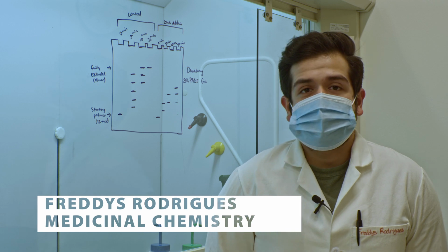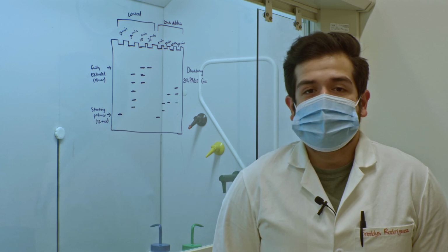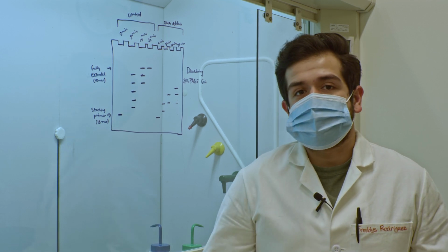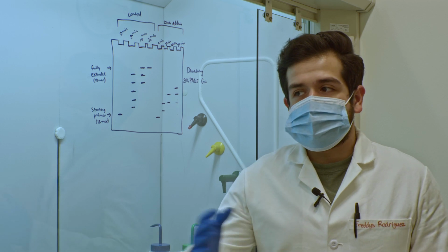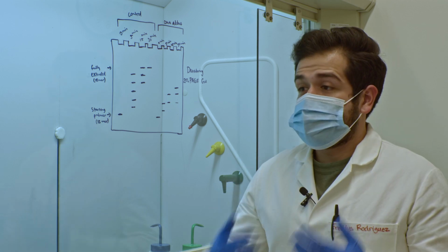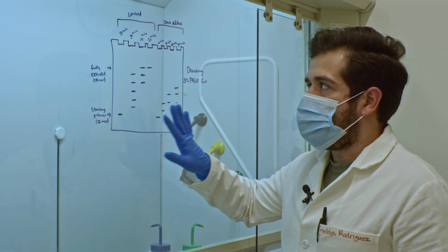Today we'll be talking about the primer extension assays. These gel assays are actually quite important in our lab, as we can study the effects of perturbations of DNA structure related to DNA transactions such as DNA replication or DNA transcription. So for today's experiment, let's talk about what's going on.